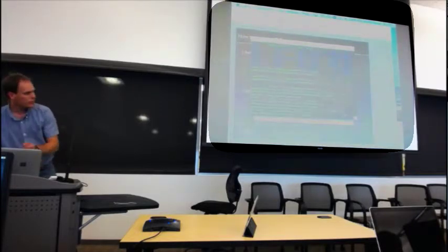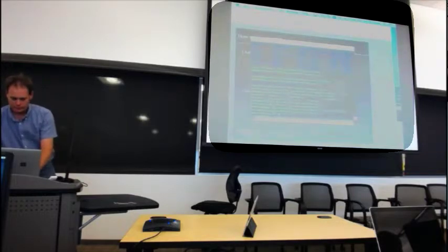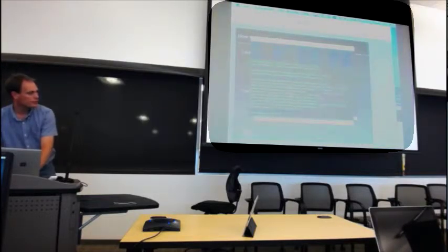I can go back to my home directory. I've got an alias to this thing, but you basically source /reg/g/cfel. What's going on here? Let me look at that directory. /reg/g/cfel is actually a central installation of things. Reg g itself is a location of things.